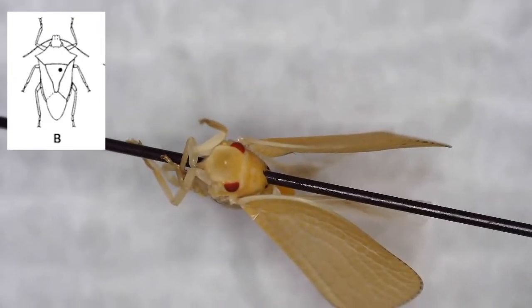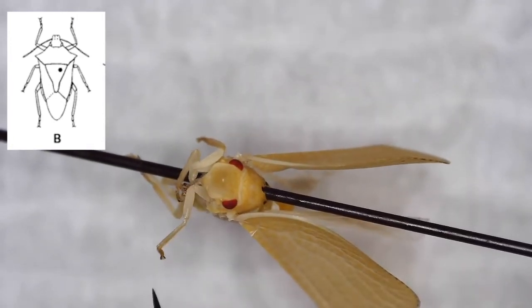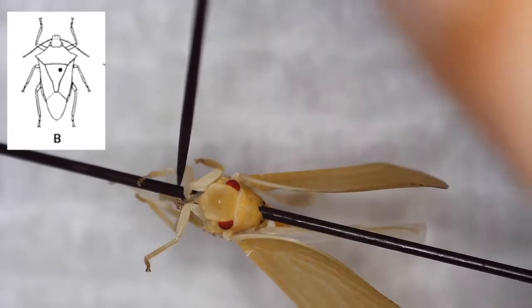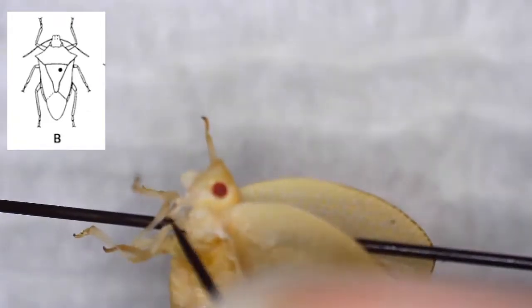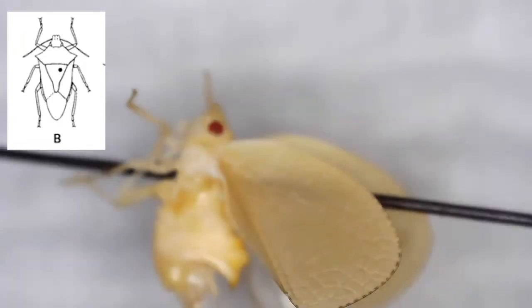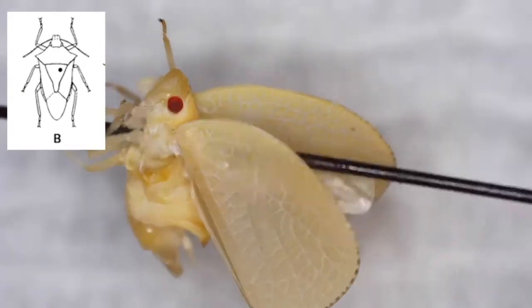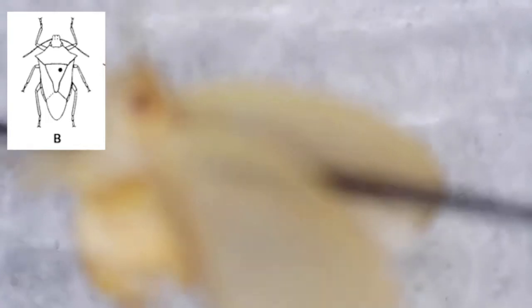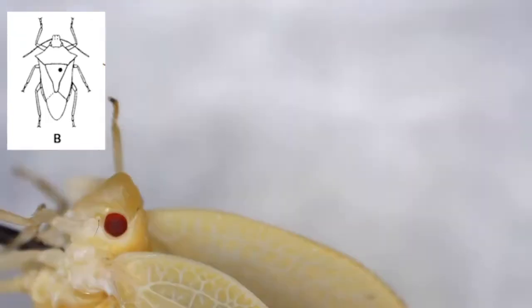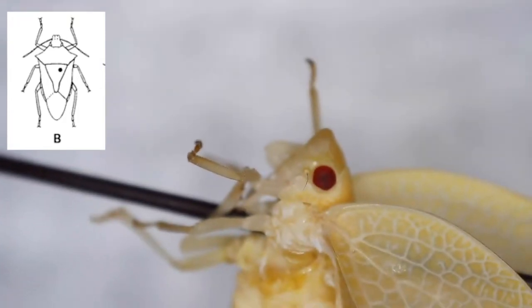So this is a hemipteran, and we can see some of the characteristic features if I move the legs out of the way, which I'm doing right now. One of the things I like about this is that it has very capable legs that make it good for jumping and hopping away. You can see the nice venation of the forewings that are meant to, in some instances, mimic leaves and other plant matter as a form of camouflage.